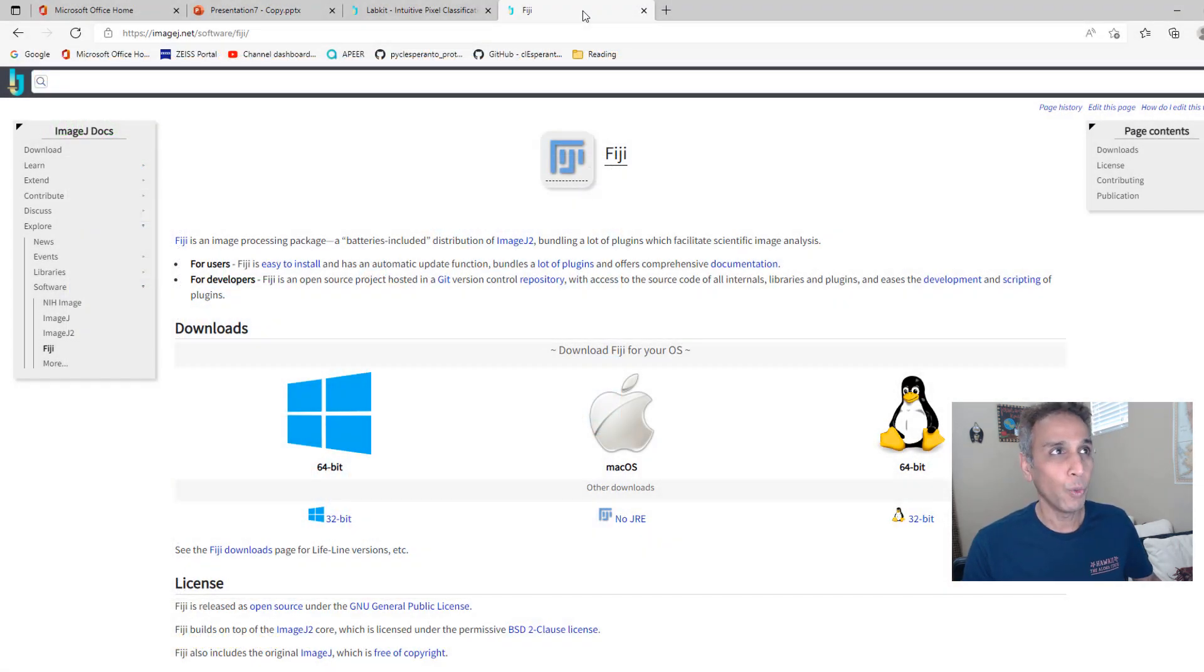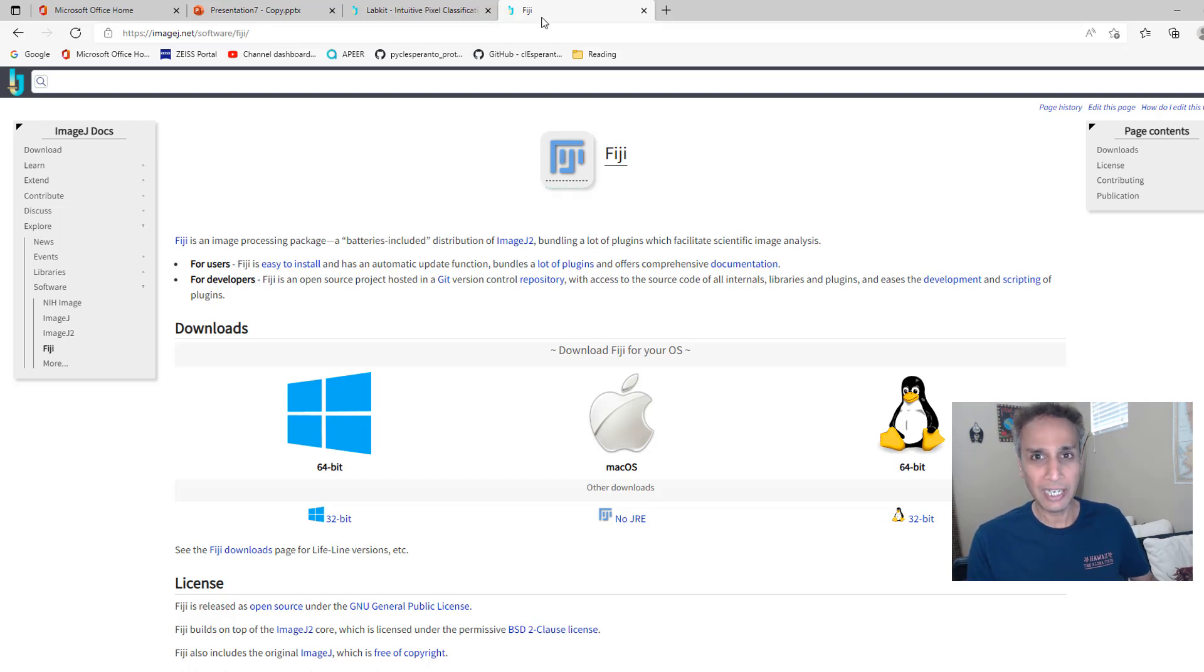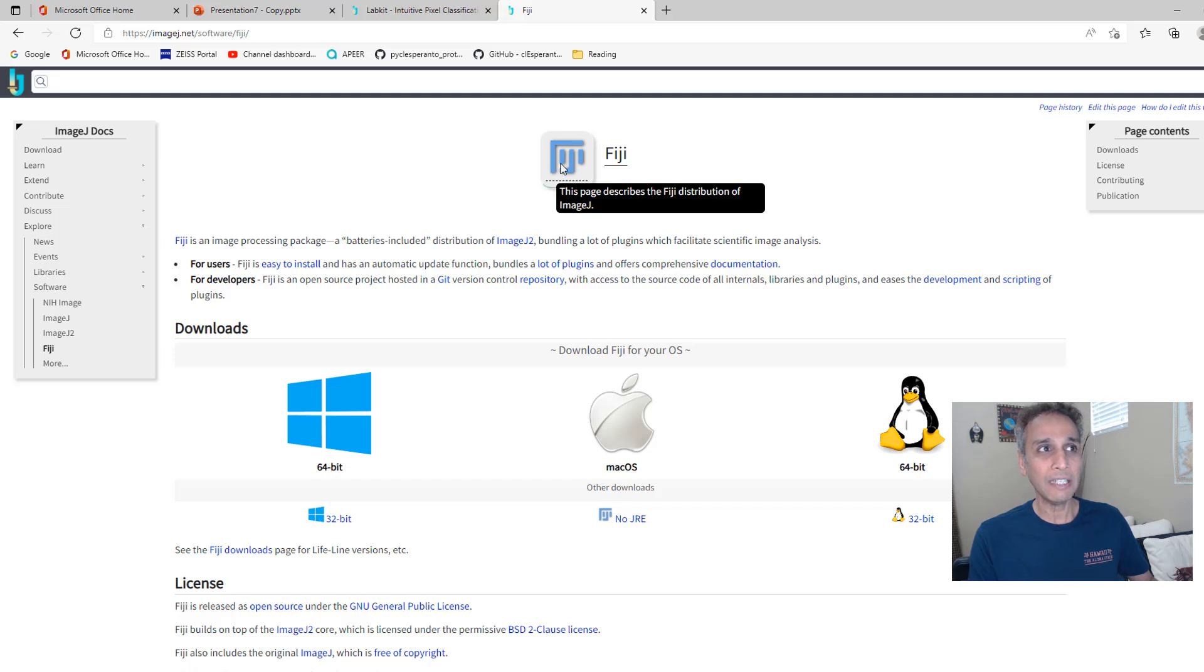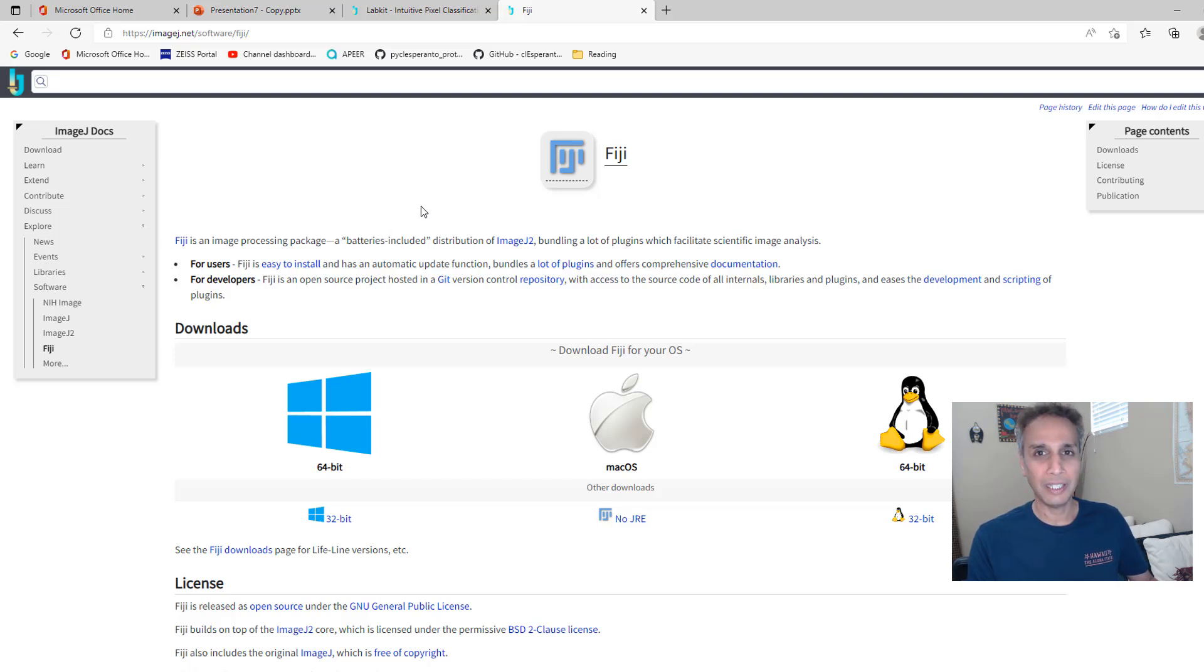I want to start by showing you how you can get your hands on ImageJ. It's called ImageJ but I usually download the Fiji version of ImageJ.